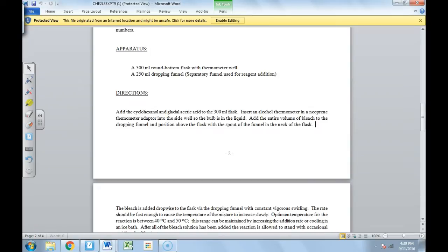So in the general procedure, as you're writing the steps, you want to make sure you include the quantities that you calculated, and you want to make sure that you include specifically the glassware with the right size, 300 milliliter flask, so that you can go into the lab and just set it up.